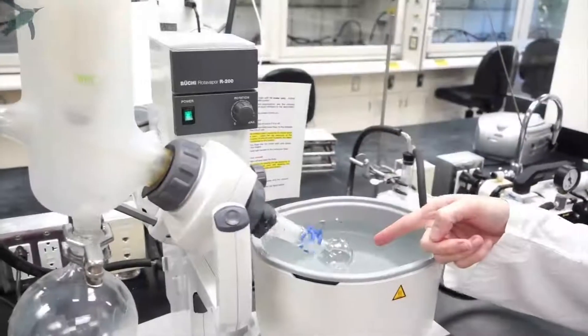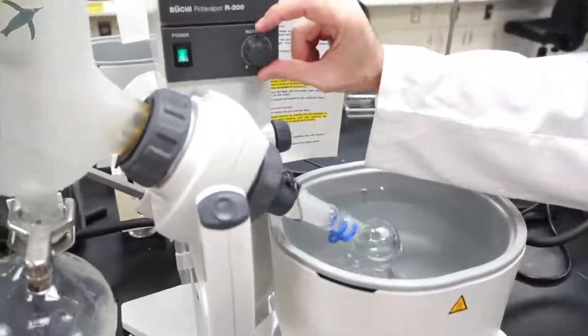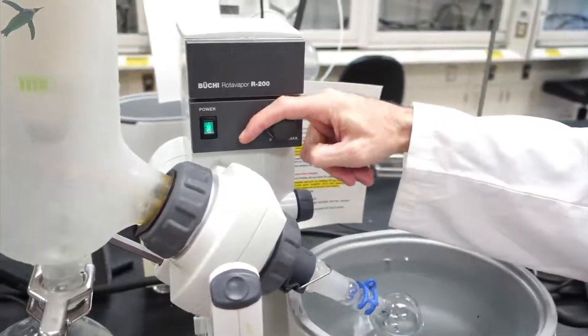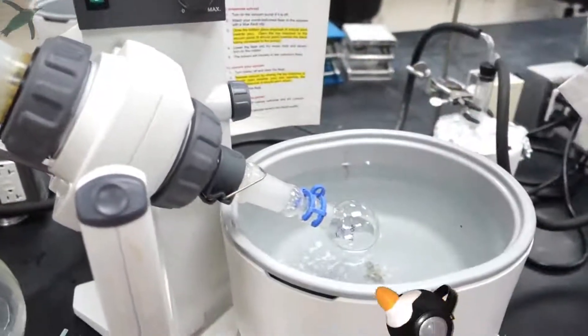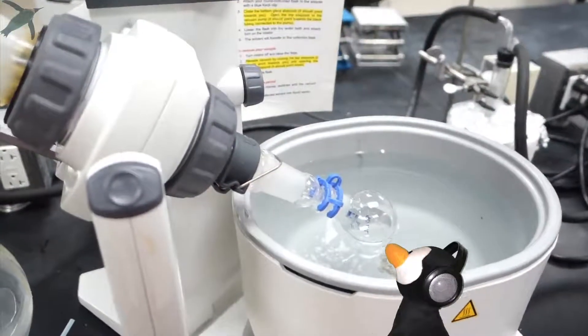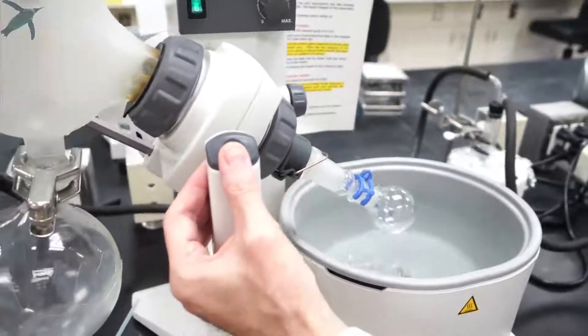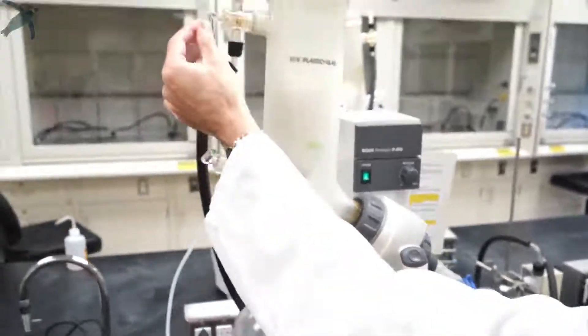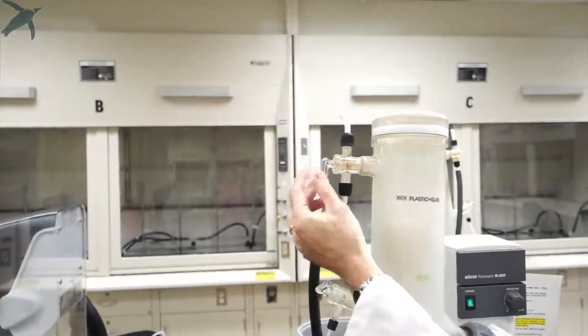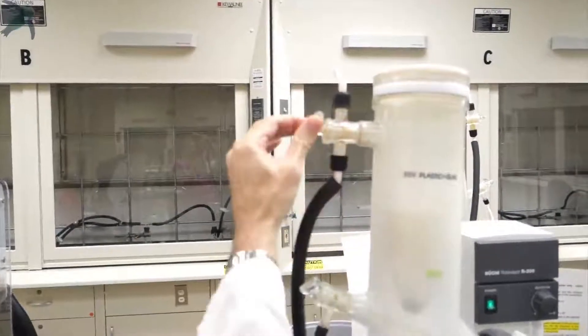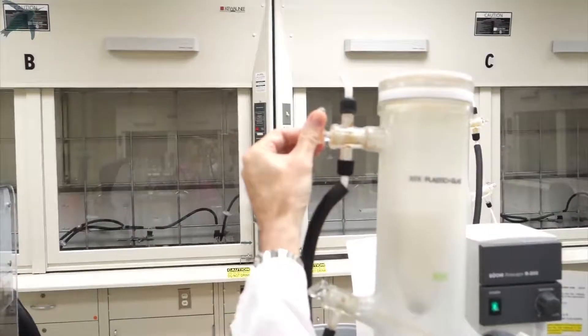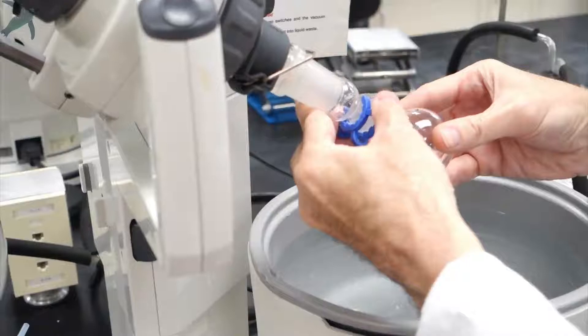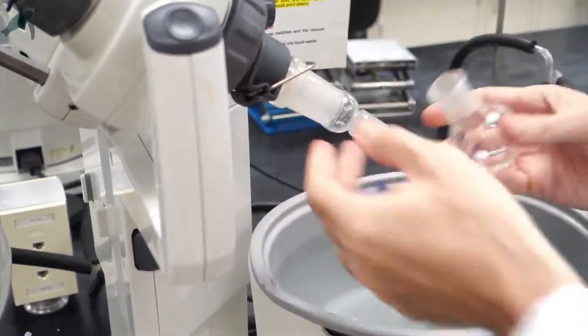When there is no liquid left in your round bottom flask, you can stop the rotation to check that. You lift your flask out of the water bath, vent the system—you want to hear it hissing—then you remove the keck clip and remove your flask.